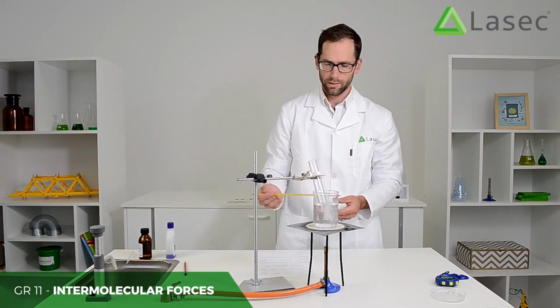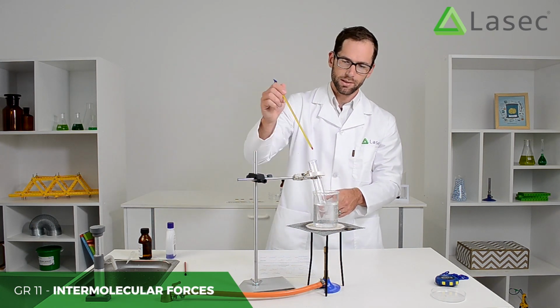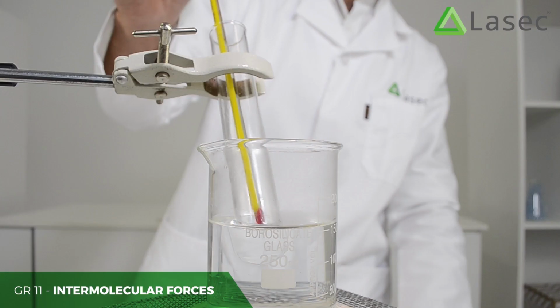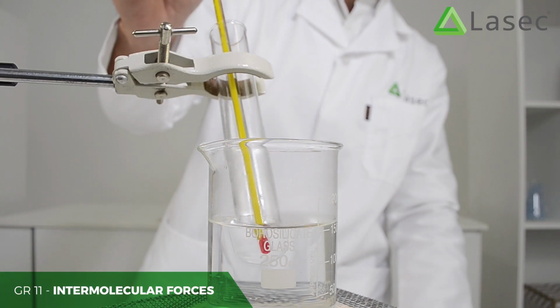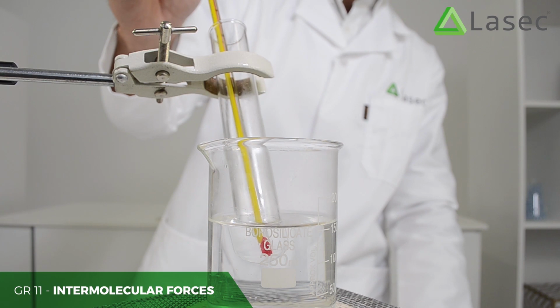Now what I can do is put the bulb end of the thermometer into the test tube, into that ethanol, not against the side, and I'm going to check that temperature when it starts to boil. You could preheat the water to a point, but I'd like to catch it as it starts boiling.